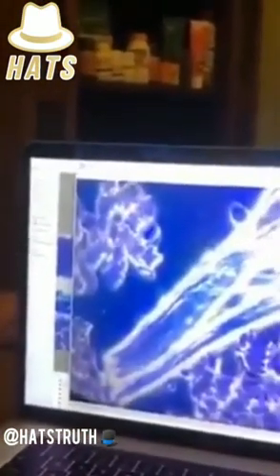Okay, so is that a new one? Did we take a look at that one? Yeah, this we haven't seen. Let's enlarge that. All right. So is this the same one or different? Again, that's unknown. We don't know what that is.